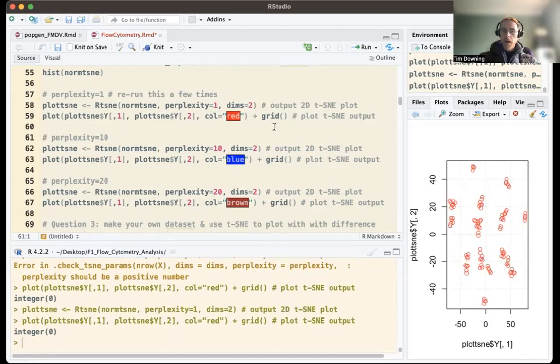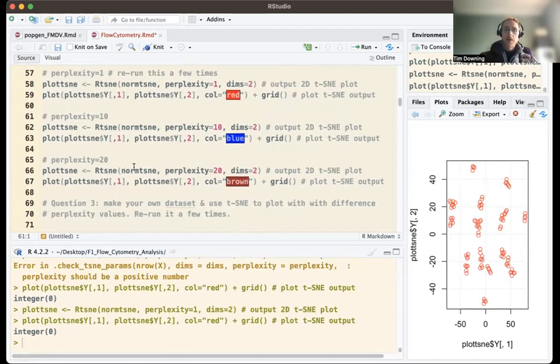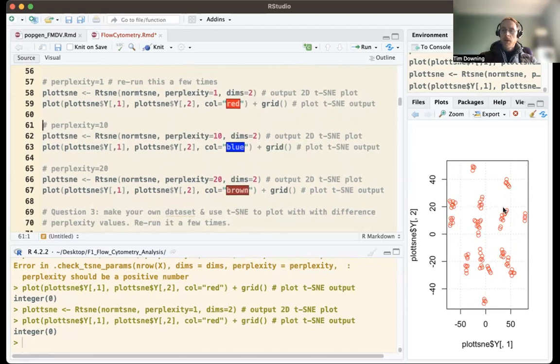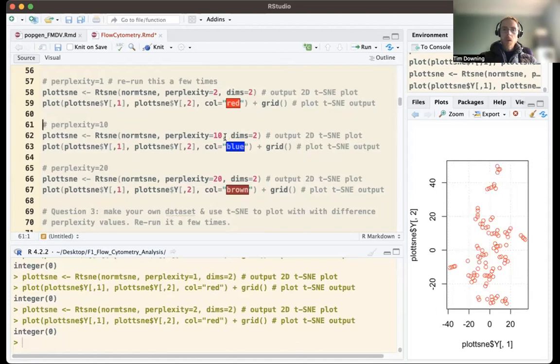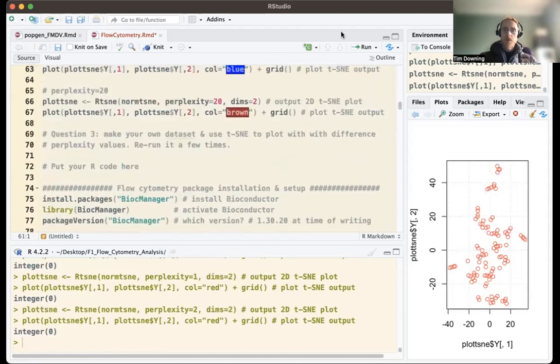You can see it's worth noting how the parameters that we put into t-SNE can affect the extent to which we have different clusters. What's important here is that just because we have different groups does not mean that they really are biologically valid. And secondly, because we're mapping many dimensions onto this space, the distances between these different groups may not be meaningful. We can see that because if we rerun this code, we get a different arrangement each time. Okay, so that concludes this part. We'll discuss this further in the lab.